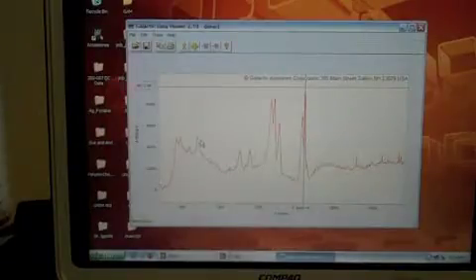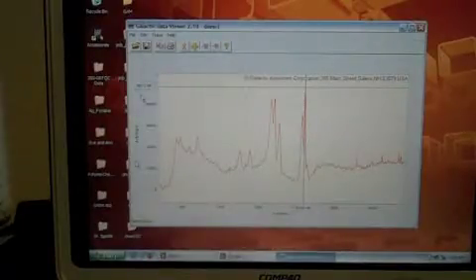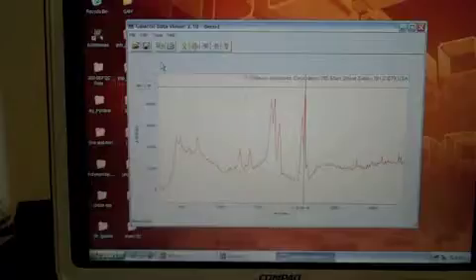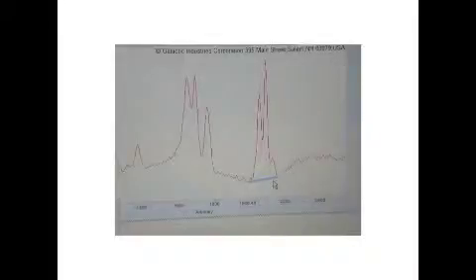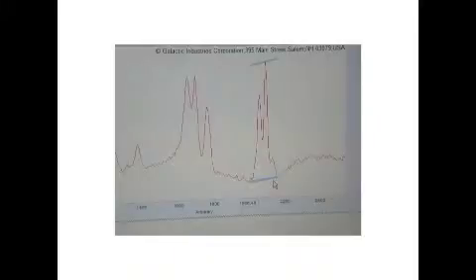Place the cursor on the top of the peak to read the absolute peak height. Imagine drawing a straight line from a point just left of the peak to a point on the baseline just to the right of the same peak. The signal that we want is the height of the peak from this baseline.